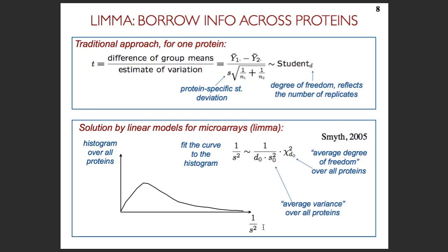I have a question. I think you already said something about it. So about the TMT, we use the relative abundance. So LIMMA and MSstats can use that. Another question is that sometimes we have some unbalanced samples. So for one group we have a lot, for another group we want to add a little. So what do you think will influence the result? Right. So TMT, hold on to that thought. We are getting there.